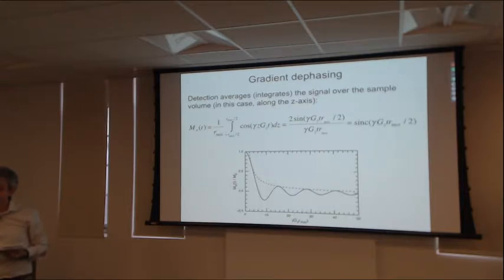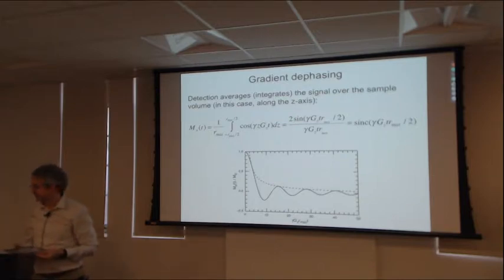And that means that a few hundred microsecond long pulse is enough to dephase proton magnetization if one sits down and works out the arithmetic. Gamma for nitrogen is much smaller, so it takes longer to dephase nitrogen than it takes to dephase hydrogen because of the difference in gamma. The frequencies are smaller. But zero quantum magnetization, homonuclear zero quantum magnetization is a problem.